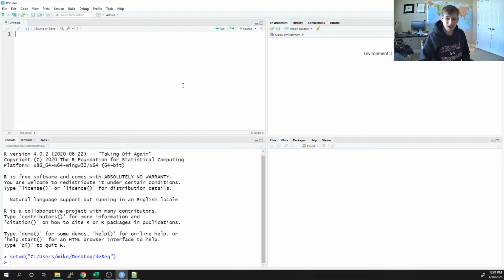I think there's also a plotCounts that can look at the normalized read count for a specific gene. That's possible. I think there's a PCA plot, a part of the DESeq package. But I'm not really going to mess with those all that much. I mean, they're certainly easy to use, but I'm just going to use a couple other plots.